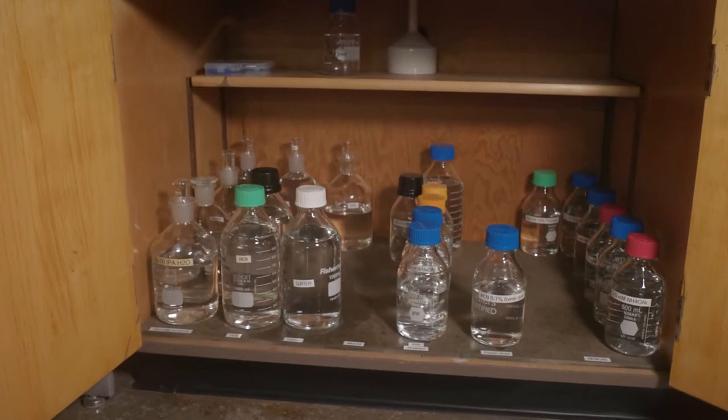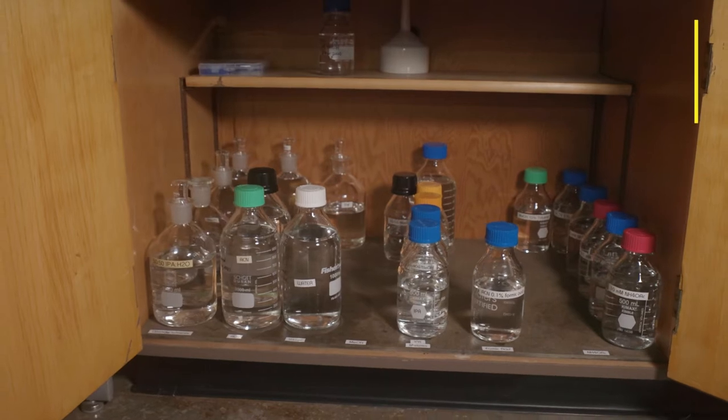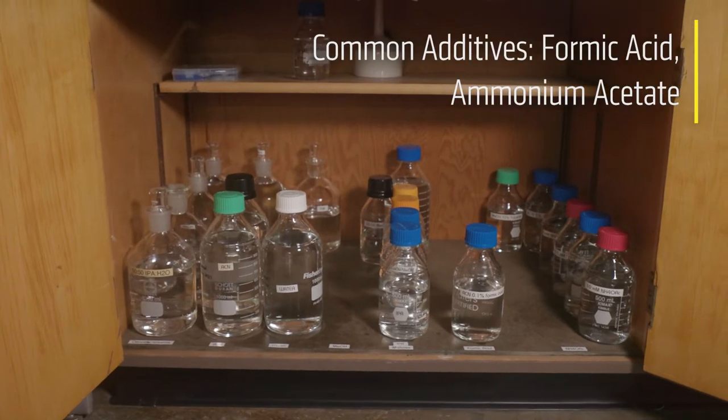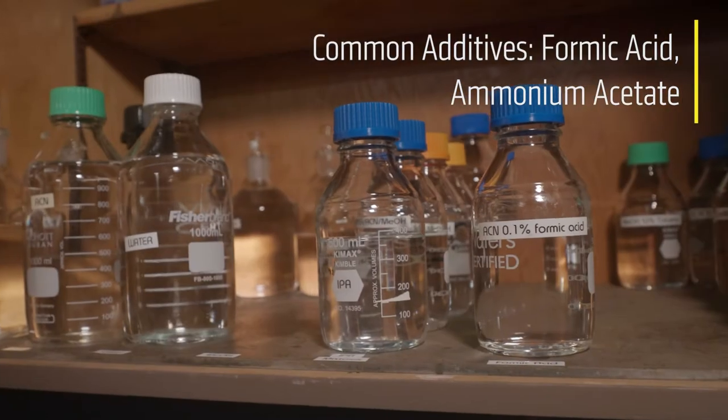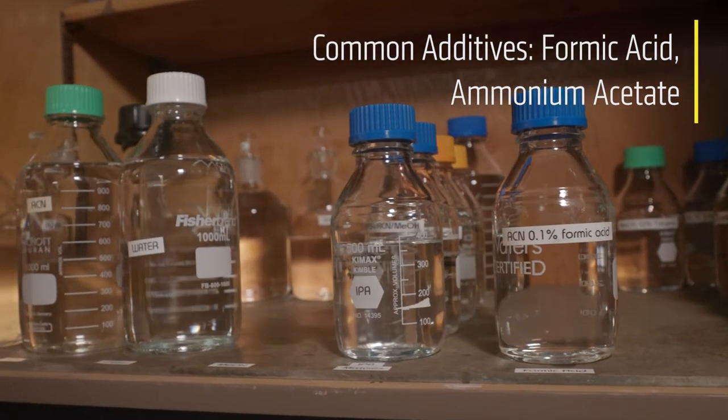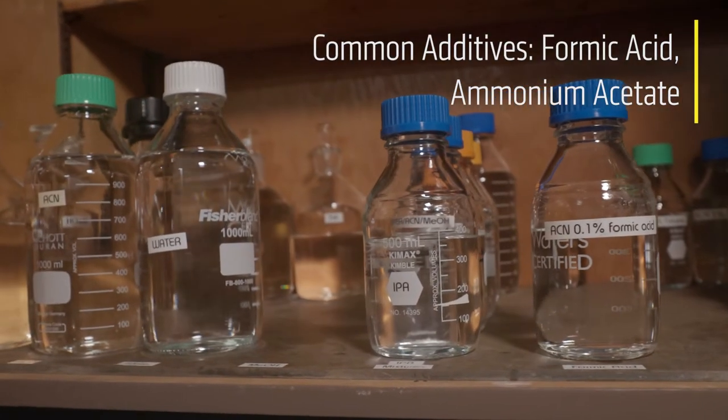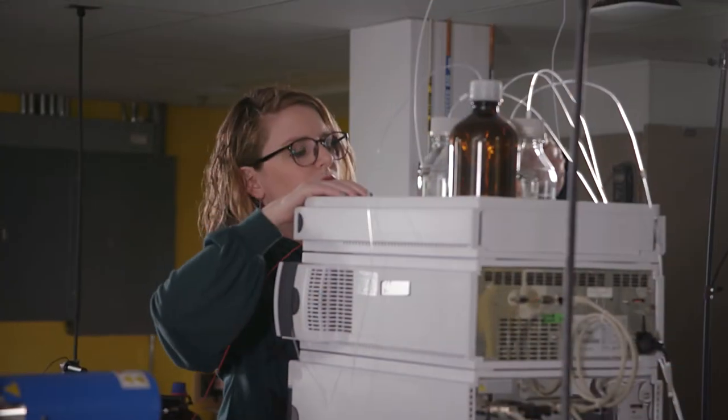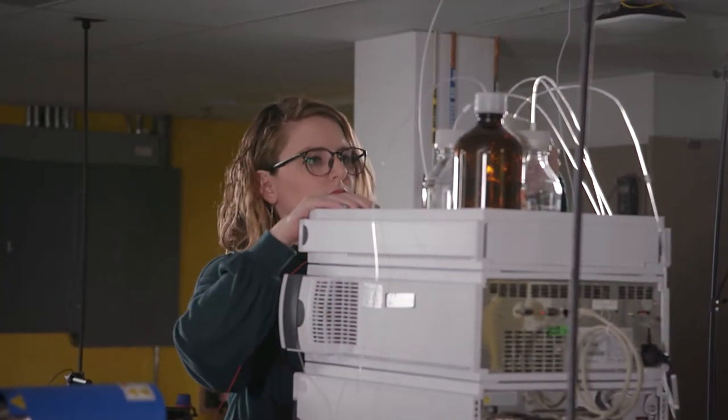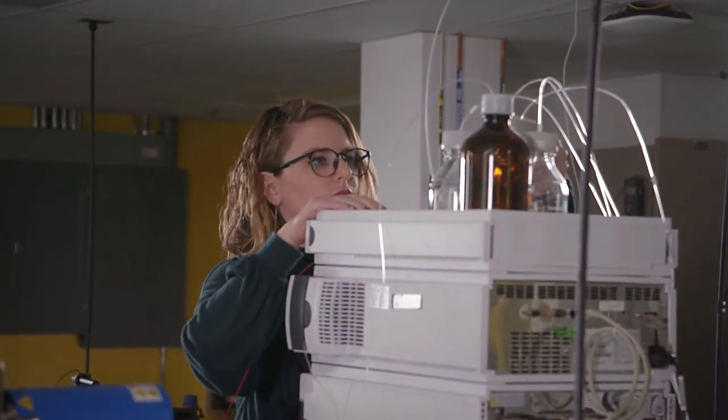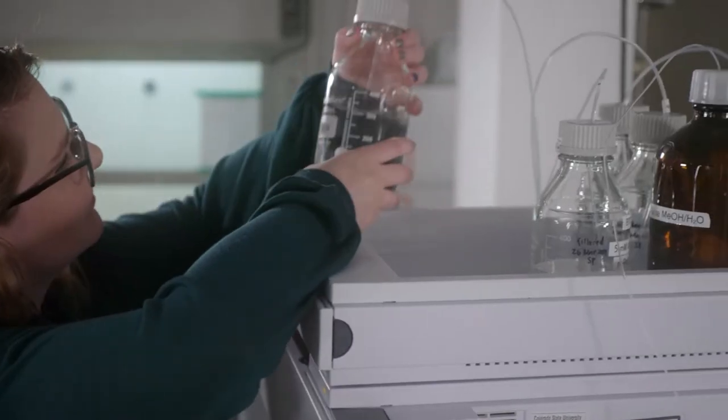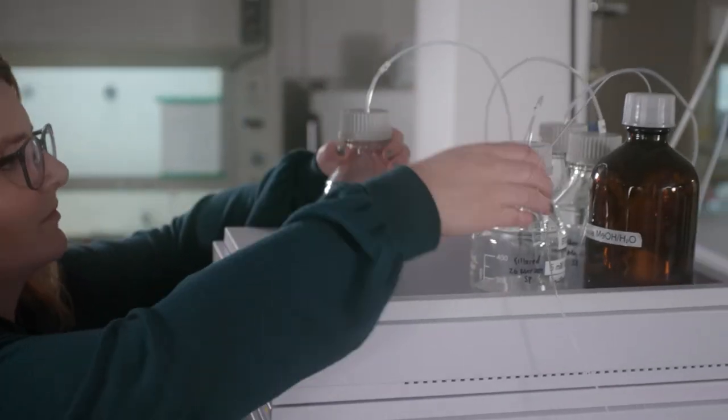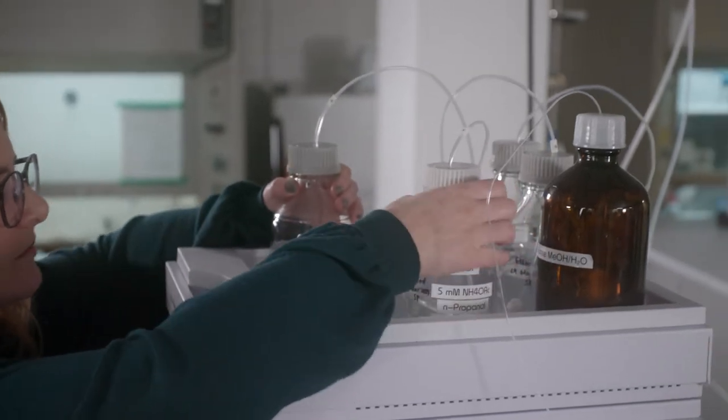Often, you may find solvent bottles with volatile additives such as formic acid or ammonium acetate added to aid in ionization. It is very important that you check the solvent bottles before you run your samples, as they change constantly.